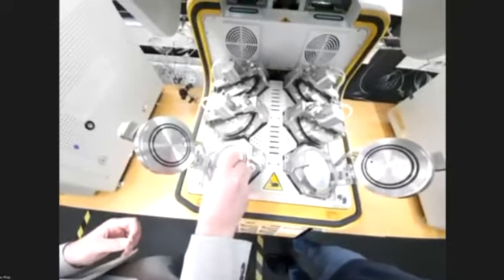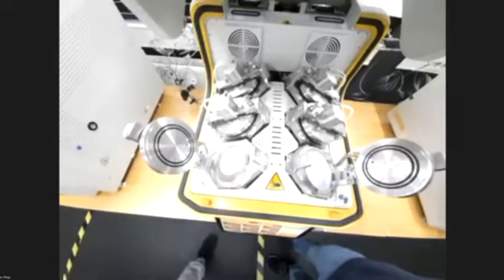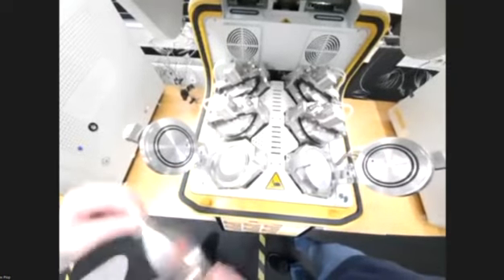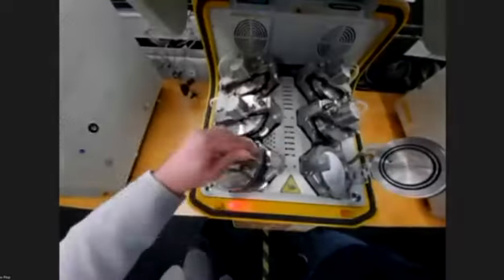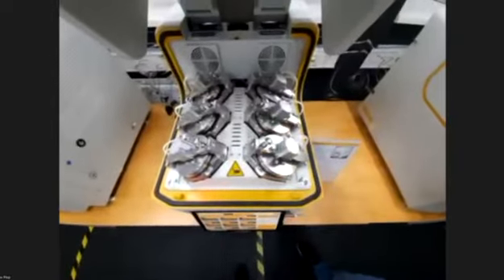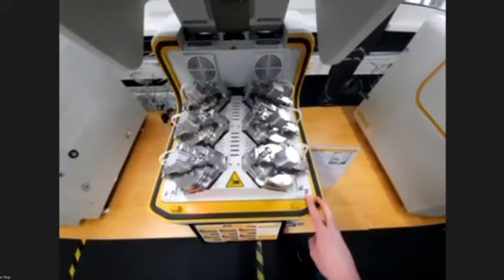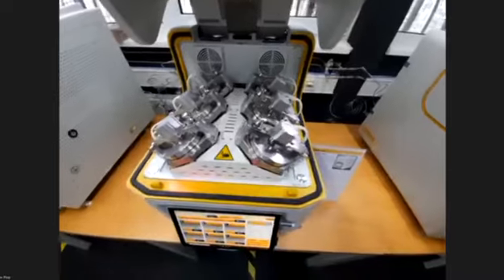We are fixing the filter paper. We take our pre-made sample, we fix it here. We're closing the cells, and we are ready to go.